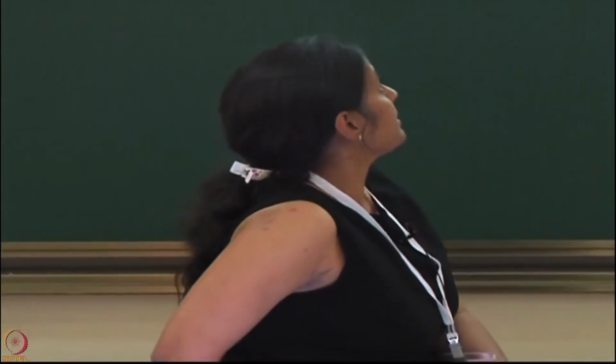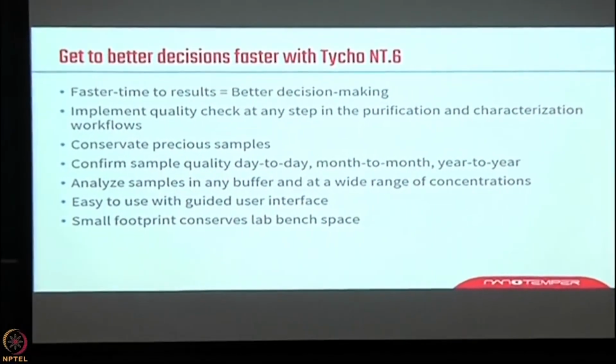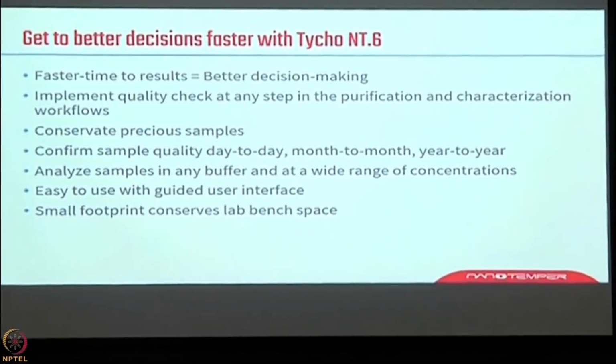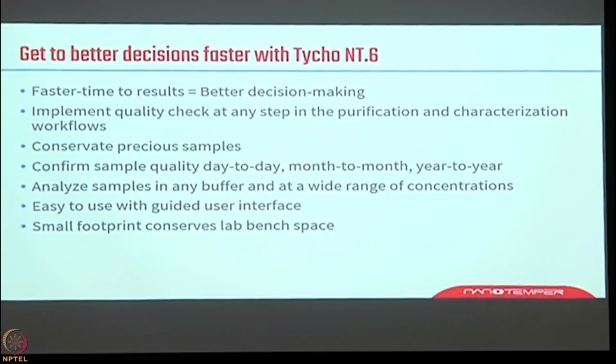The basic benefit is that it is a faster measurement technique, and it checks at the purification and the characterization levels. If you have batch-to-batch samples, or 1-day-old, 10-day-old or very old samples, or you are freeze-thawing the samples, you can check them one by one for the actual purity, whether it has denatured or not. Like that, you can always check batch-wise.